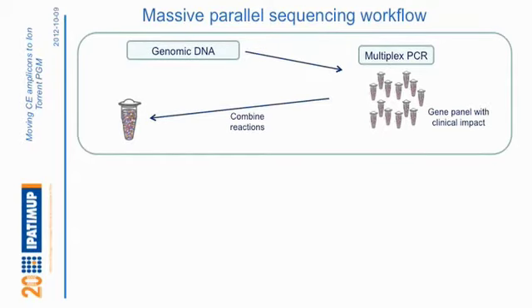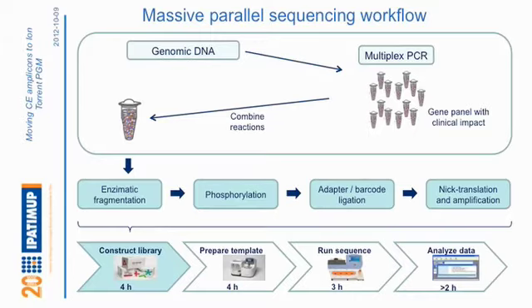So, very simply, this was actually the major shift that we had to make in the procedure that we used to follow. After isolating genomic DNA and performing the different multiplex reactions, instead of splitting all the different amplicons and performing the sequencing on the individual amplicons, we did the opposite. We mixed all the multiplex reactions in a single tube and used that tube for entering the standard protocol for preparing samples for the Ion Torrent.